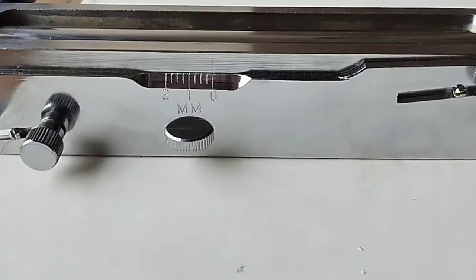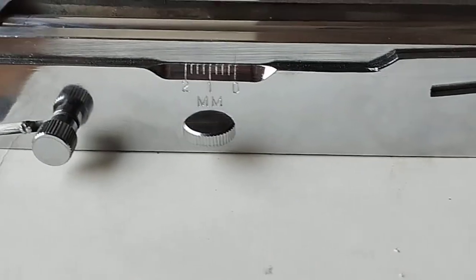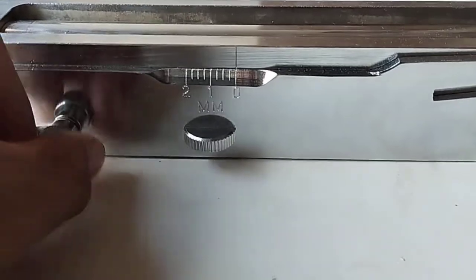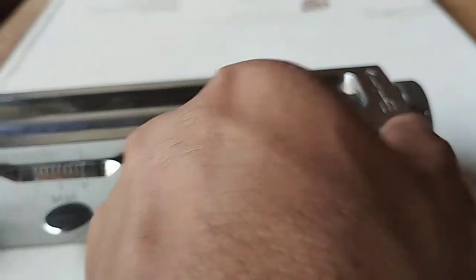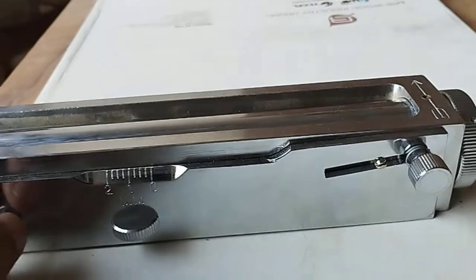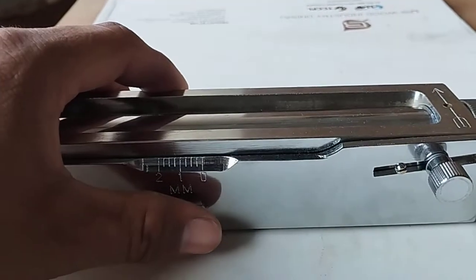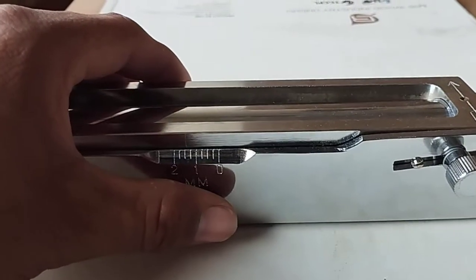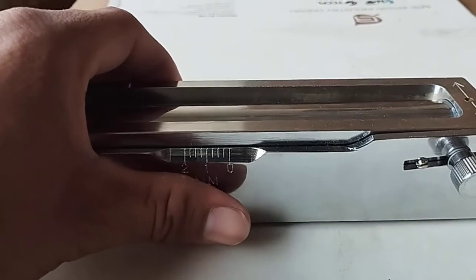As you can see, there is a marking to set up the size of the layer. You can just loosen these nuts, and once you loosen these nuts, you can easily set up how much thickness of the layer you need. You can set up the layer as required.